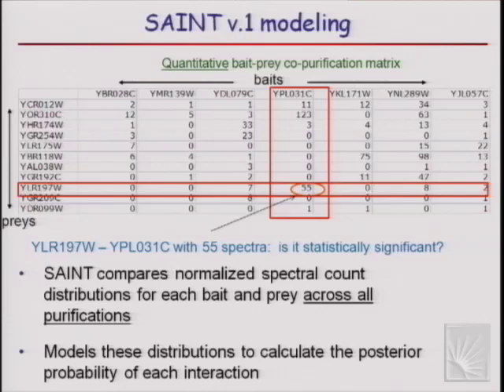So this is all spectra for all peptides? This would be a spectral count here, but in the kinome study we ended up using unique peptide counts, though for other data sets we typically use spectral counts. Is that your question? Are all of the spectra from all of the peptides represented in that one number? Yes, in this number, right. But sometimes, instead of using the total spectra for all peptides, we would just count how many unique peptides we have, regardless of how many spectra we identified for each peptide. Or, and I'll get back to that very quickly, when we have peptides shared across several proteins, we have to do something else. But that's just an illustration here, where we can assume that all spectra are used.